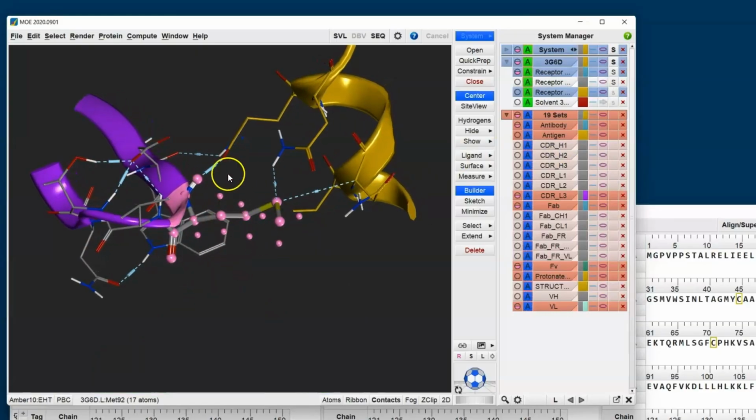So I'm going to want to mutate this residue to something that's not hydrophobic in order to help break up that hydrophobic region. Of interest, I can see 2 bonds here. So this is important. I'm going to want to keep or even improve upon these interactions. I certainly, at this point, don't want to negatively impact the affinity or any other property. So I'm looking for something of a similar shape and size. And for that reason, glutamine comes to mind as a suitable candidate for mutagenesis.